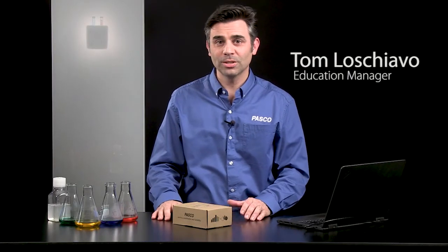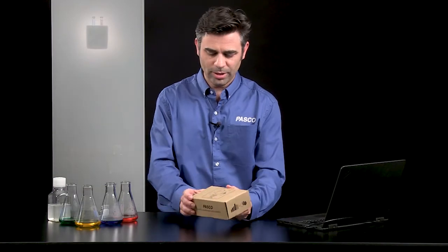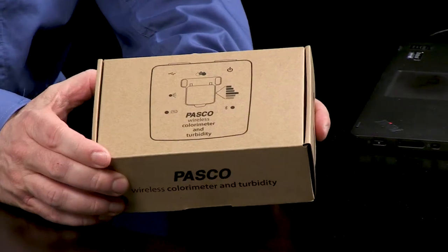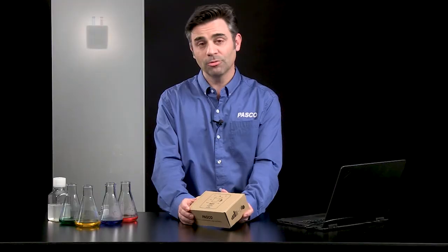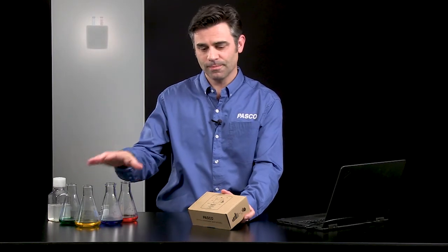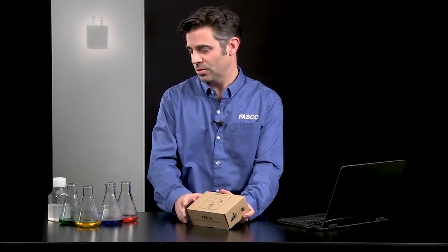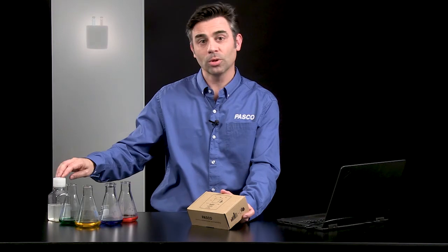Hi, I'm Tom Loschiavo, Education Manager here at PASCO Scientific, and I'm here today to introduce the wireless colorimeter and turbidity sensor. The colorimeter is great for measuring colored solutions, and the turbidity sensor is great for measuring the quality of water samples.